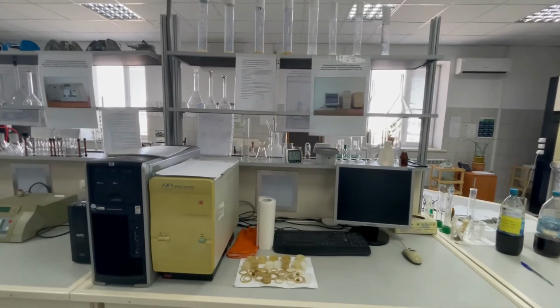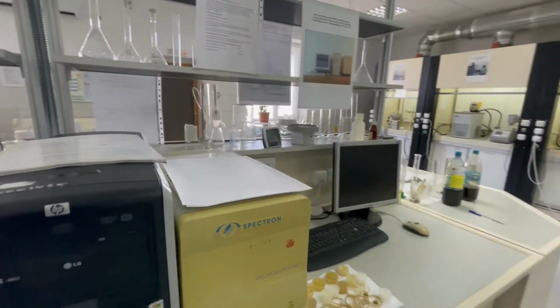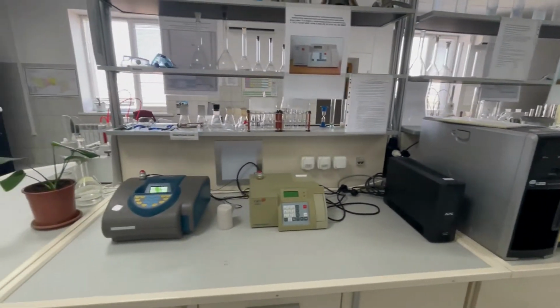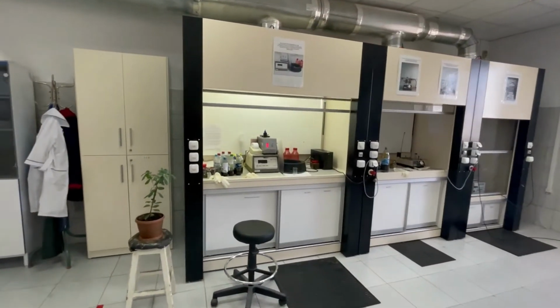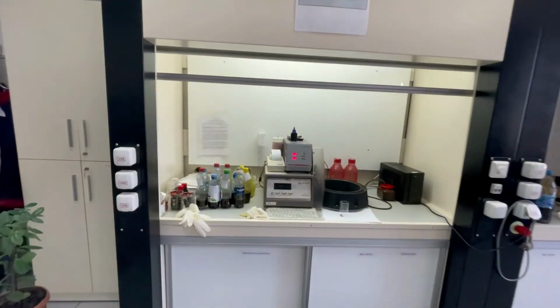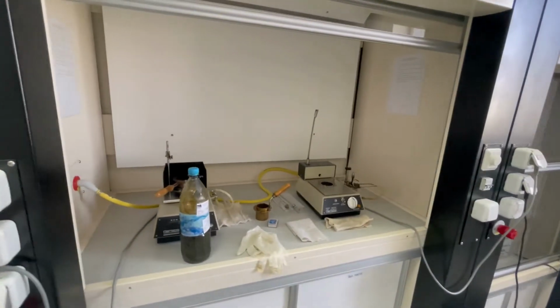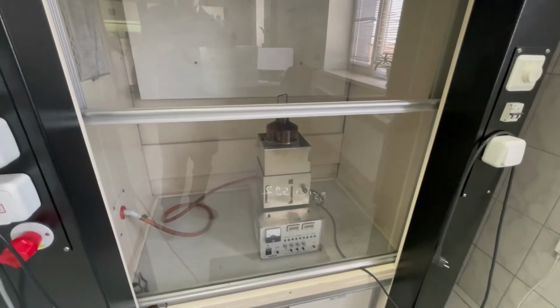Here in the Oil Research Laboratory, we have a spectroscan for analysis of heavy metals in the composition of oil. Also the spectroscan for general sulfur composition. Here we have a Stabinger viscosimeter and the analysis of a flash point, heavy residual such as coke.